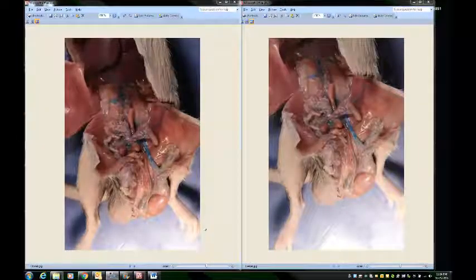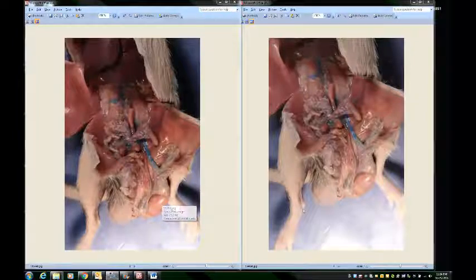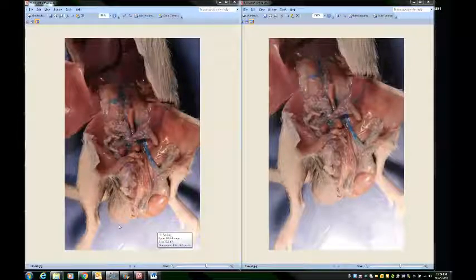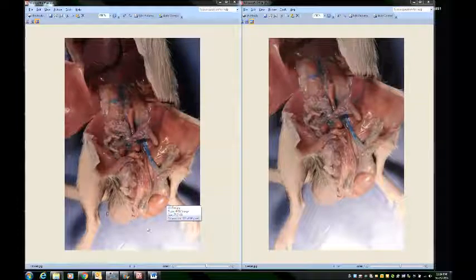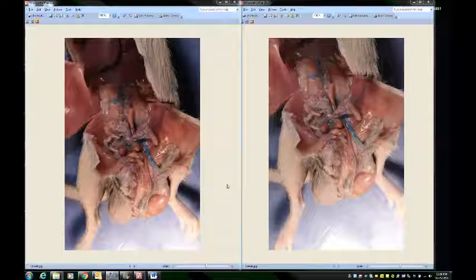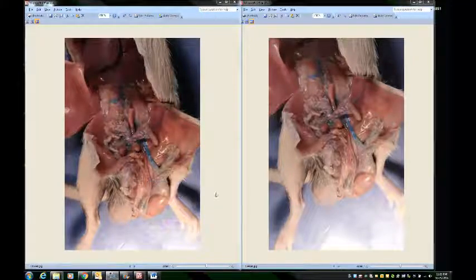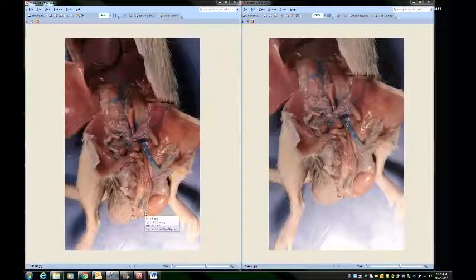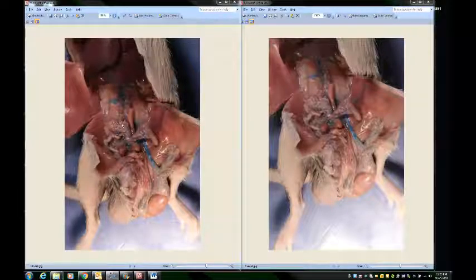Here we have two pictures of the male rat's reproductive system. On the rat's left side it has been dissected open so you can see the individual testis, and on the rat's right side it is still covered. Remember that the testes are in the rat's scrotal sac, which keeps them outside the body so the rat can maintain a temperature optimal for sperm production. Along with the testes, you will need to identify the vas deferens — the long tube running alongside each testis — and the seminal vesicles, which look kind of bubbly, are hard to the touch, and will usually have a pin through them to help you identify them.